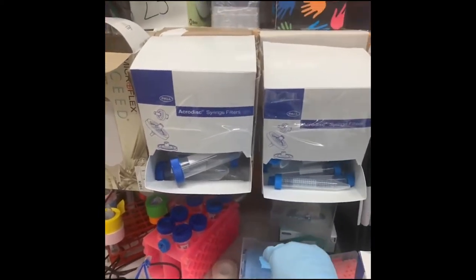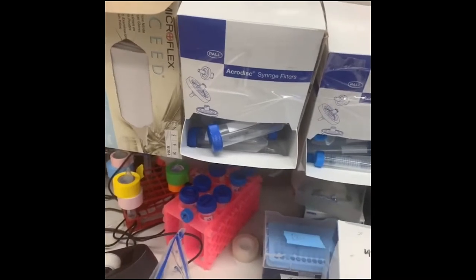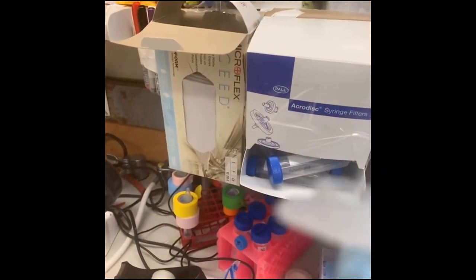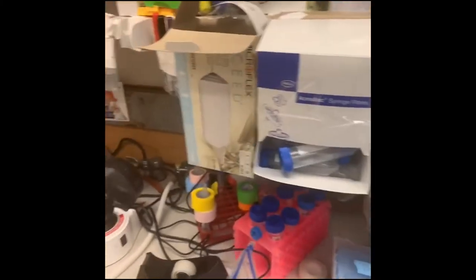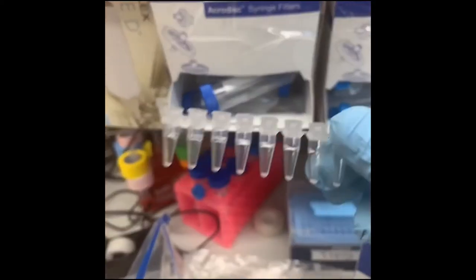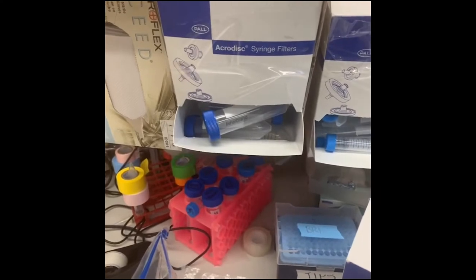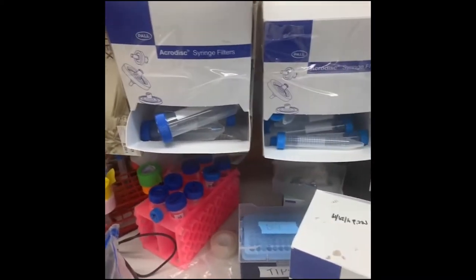I make little recycled lab boxes and stuff to hold things on my bench. But probably the tube we use most often is the Eppendorf — another brand name — which is this microcentrifuge tube that usually holds about 1.8 milliliters. And if you think that's small, wait until you see the PCR strip tubes. These are for PCR, that method to copy lots of DNA in the machine. These tubes are a lot smaller — about 0.2 milliliters, which would be 200 microliters, to put it in perspective with the pipettes we talked about earlier.